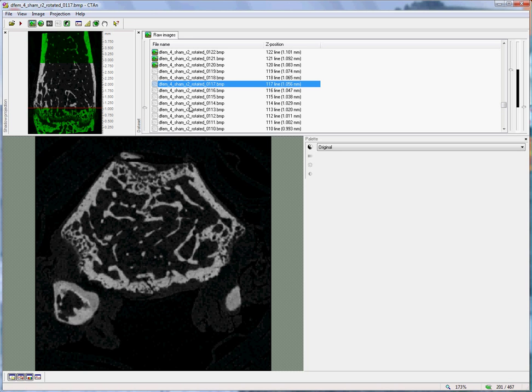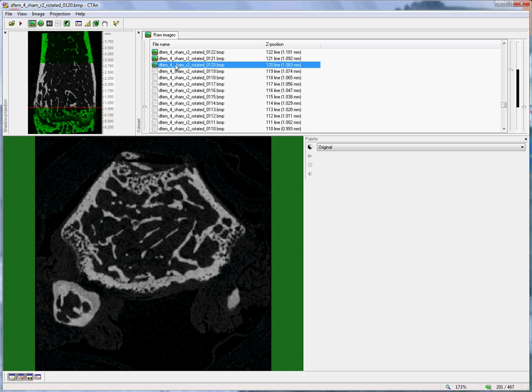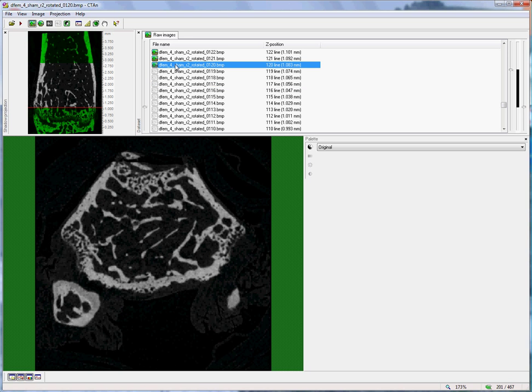That is why we need an offset between the reference level of the growth plate and the start of our trabecular volume of interest. Now, we choose the offset ourselves just by looking at the dataset and finding how many slices we need to move to get safely into this region of mature secondary trabecular bone.